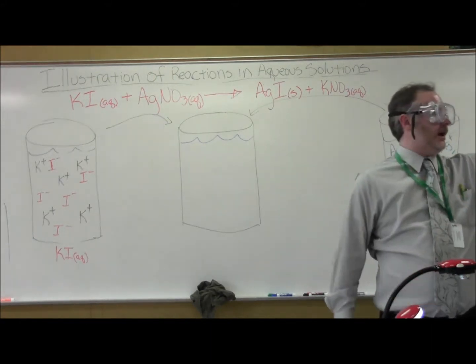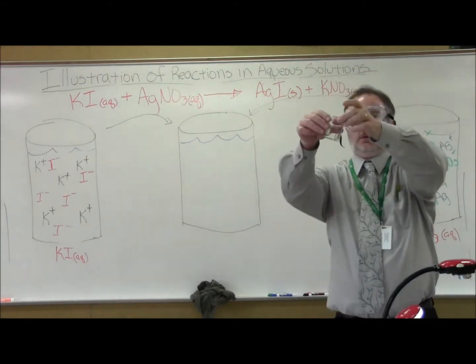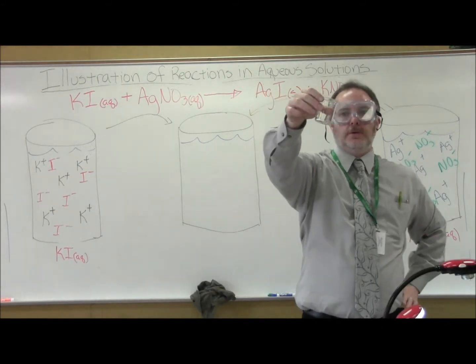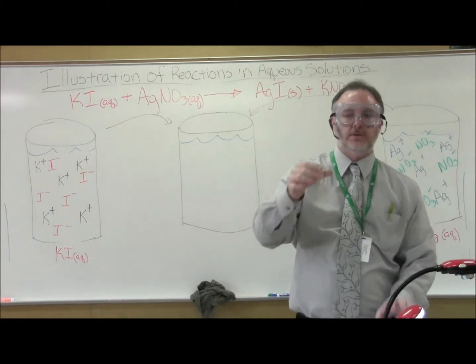Alright, so there's my KI. Isn't the AgNO3 like $200 a bottle? Well, the powder is not this right here. We use the powder to make sure.